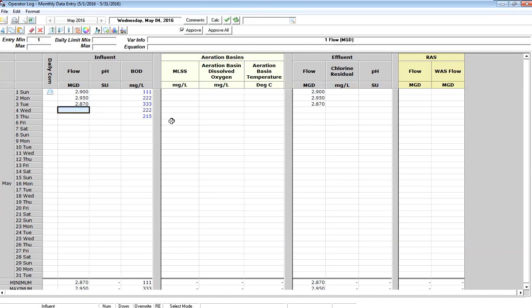To enter data, I simply click on the cell, just like I would in a spreadsheet, and type in my data point.